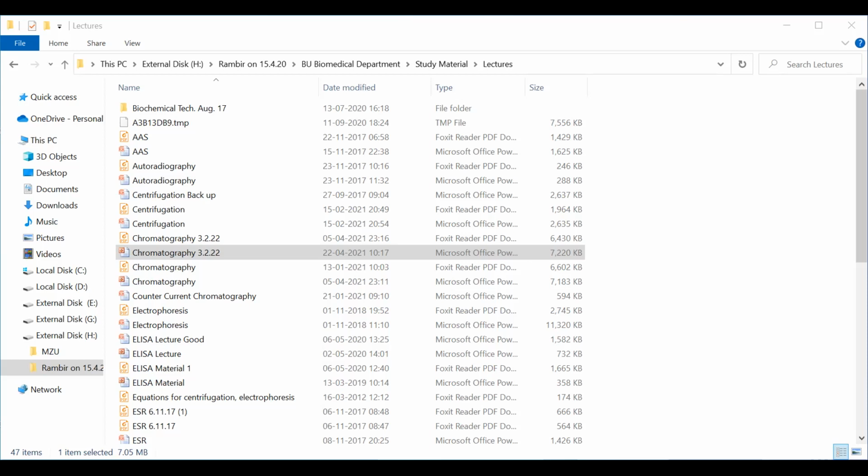The maximum ingredient is water, and in water we mix an organic solvent, right? Because water is highly polar. We discussed in our previous class that since water has only two bonds and both are polar, it is one of the most polar solvents available to us. Now, if you mix any organic solvent with water, generally we mix either acetonitrile or methanol.